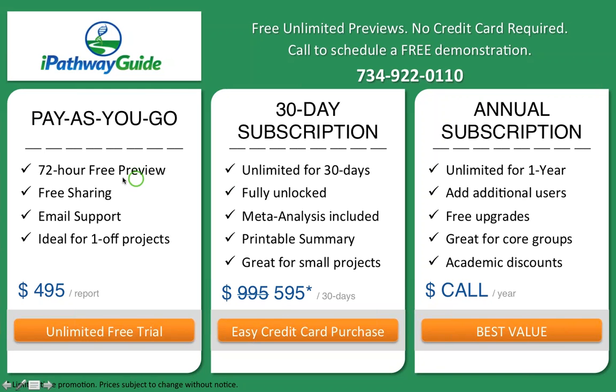So we have a pay-as-you-go model, and that's where you get to submit a data set or as many data sets as you need. And for each of those data sets, you're going to get a 72-hour free preview. You can click around as much as you want. The only thing that's restricted is the downloading and that printable summary. And those are great if you just have maybe a one-off type of project. And those are $495 for each report.